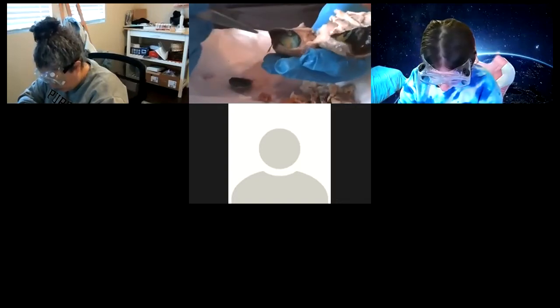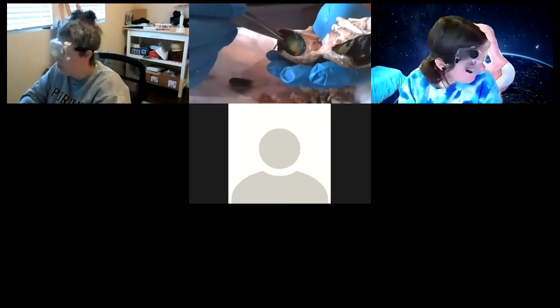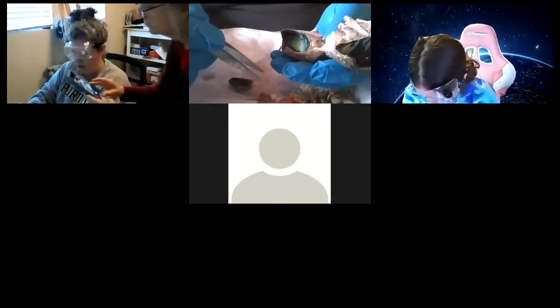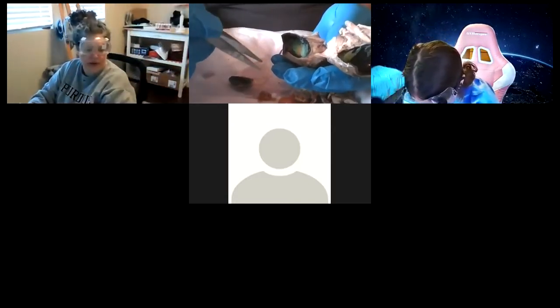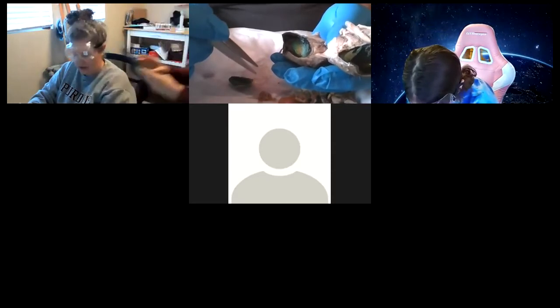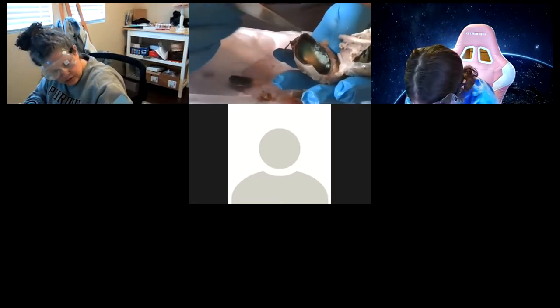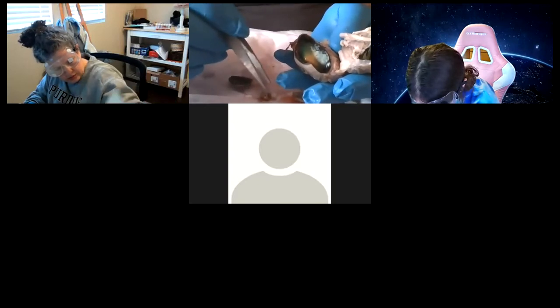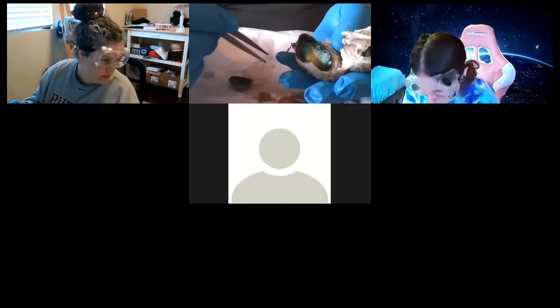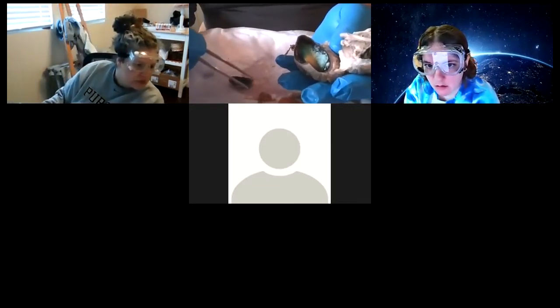The innermost layer — the retina — there's a piece of it here. The middle layer is called the choroid. As you do your special senses, you'll learn the iris is part of the choroid layer. The ciliary bodies are also part of the choroid layer, and the ciliary muscles are attached to the iris. The choroid layer is a vascular layer. The fibrous outer layer is connective tissue, the middle layer is choroid — which is the vascular blood supply — and the inner layer is your retina, which is nerve tissue, the photoreceptors and the optic nerve.